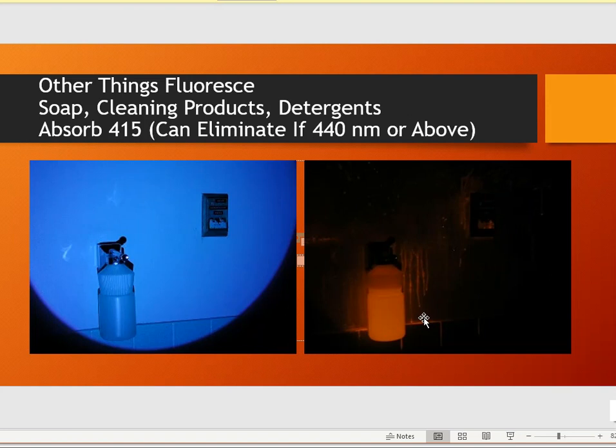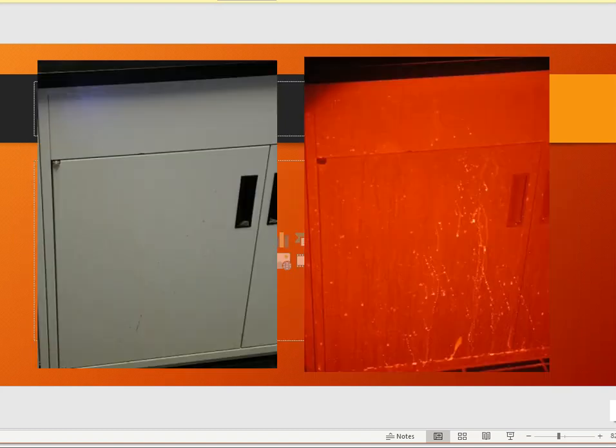We still circle those areas that are showing up as a positive readout. We will still swab those areas, but keep in mind that those areas might actually come back and there will be no body fluid. It will not be blood. It will not be semen. It will not be any other body fluid at all, period. And that is one cross-contamination or culprit that we see.